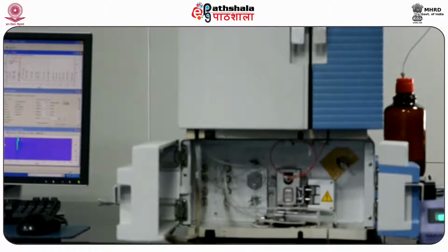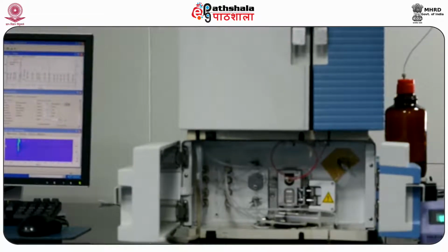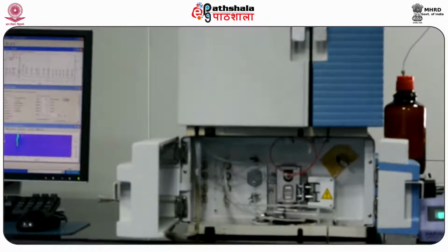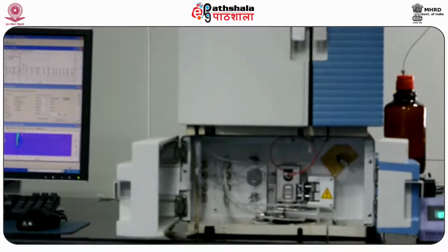The solvent is getting transferred, but before it gets into the column, it goes through the injector port, and the injector is an auto injector here.